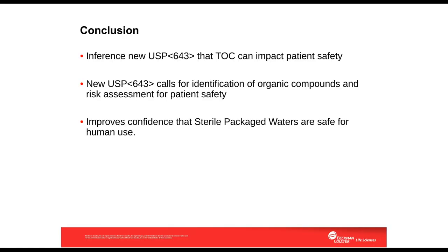So this is bringing me to the end of my presentation today, and in conclusion, I'd like to draw parallels between this new USP 643 chapter and the subvisible particle contamination in parenteral drugs testing, chapter USP 788, where for small volume containers, the pass-fail criteria is based on the total number of particles per container.